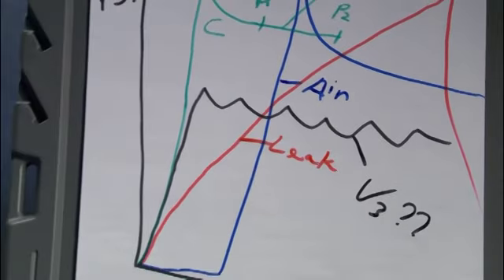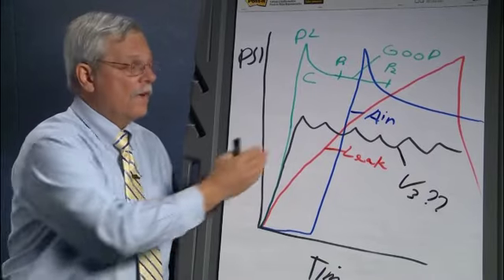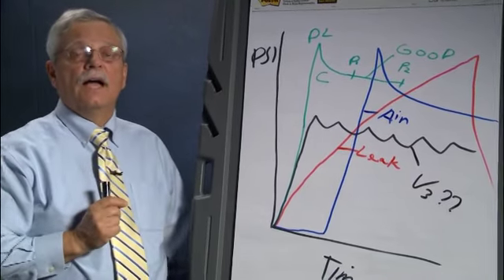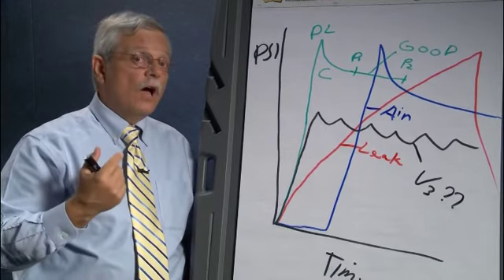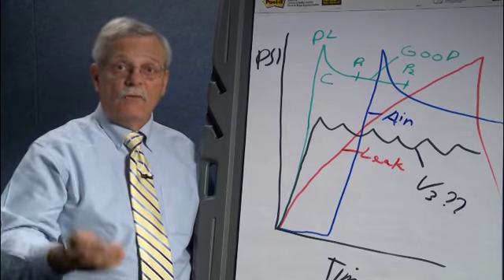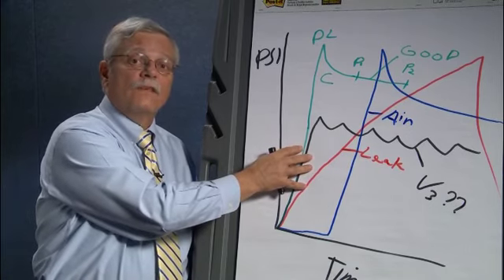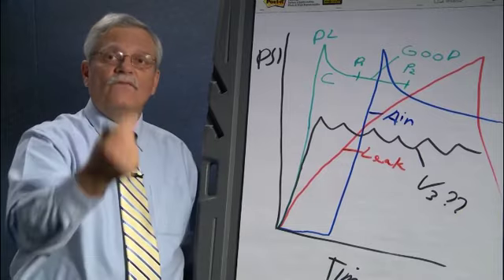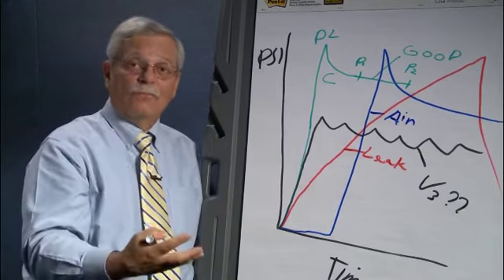Now, from personal experience, I've had a machine that did this. The valve opened up at about 40 psi, and yet it would still give me good results. I still got very good reproducibility, better than 1/10 of 1% on area counts and such, because when this machine is drawing the sample, this system is under a vacuum. It's not under pressure. When we do the compression test, it's under pressure.